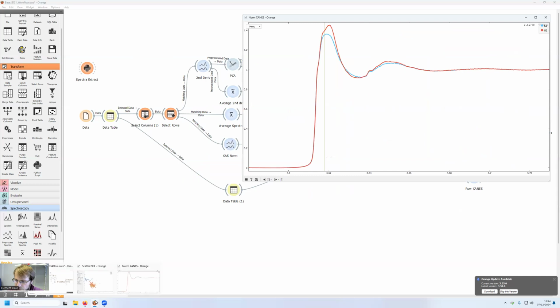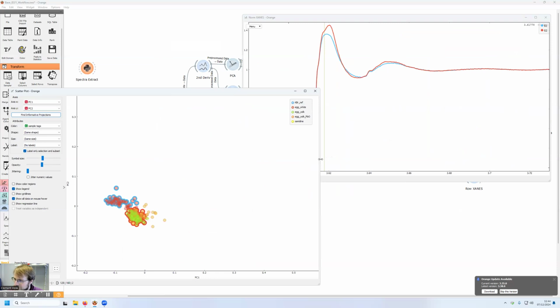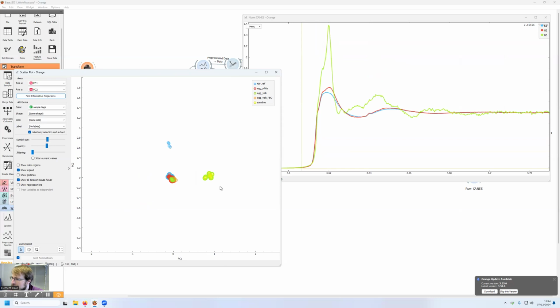The color of the spectra in this window is the same as the color of the spectra in your selection. So here, my blue spectrum is the points that are surrounded in blue, in my case, egg white, and my red spectrum is both egg yolks mixed together. When you are selecting, this is live updating, so if I hit Shift and select the sanidine, for instance, you will see the sanidine appear in green like here. And once again, for the KBR, you will see the KBR appear in orange.